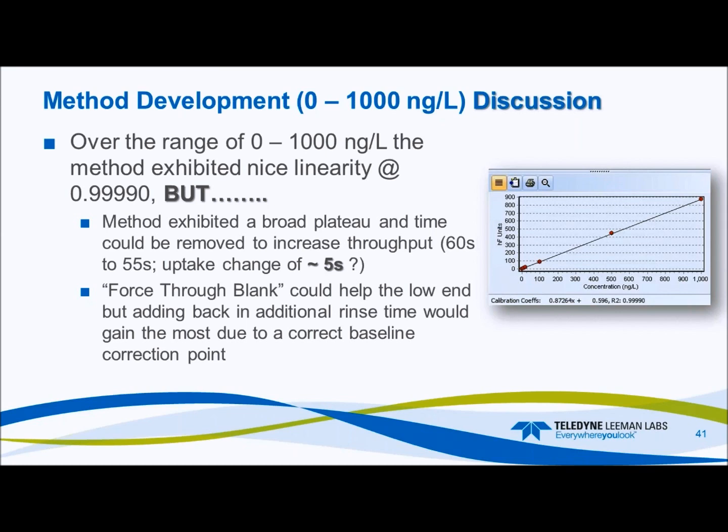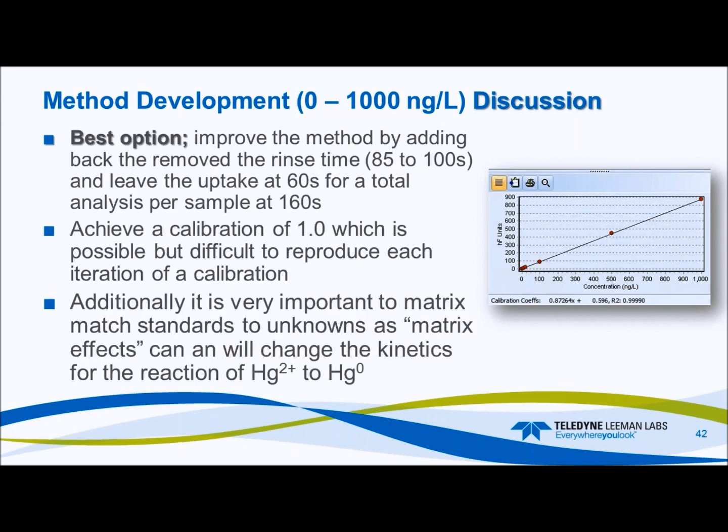That's on the table as well. That may have given us some slightly better numbers too. But again, when you look at those readbacks from that 0 to 1,000, they were all pretty close and probably very conducive to a nice method and more than acceptable to a quality control manager in any lab.